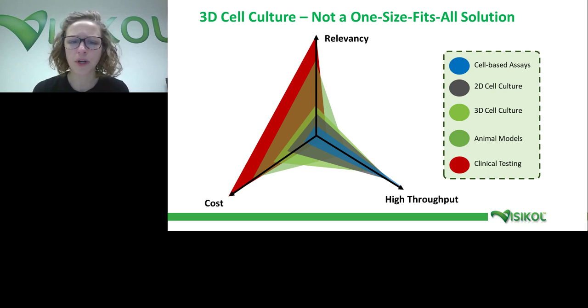They're much higher throughput, so they allow us to run many more assays than can be accomplished with 3D cell culture models. A lot of the time-consuming portions of running these 3D cell culture model-based assays comes from actually evaluating the entire tissue. So rather than taking one optical plane, if you're using imaging to analyze your tissues, instead you have to take a series, maybe 10, 15 Z steps in order to really fully characterize those tissues.